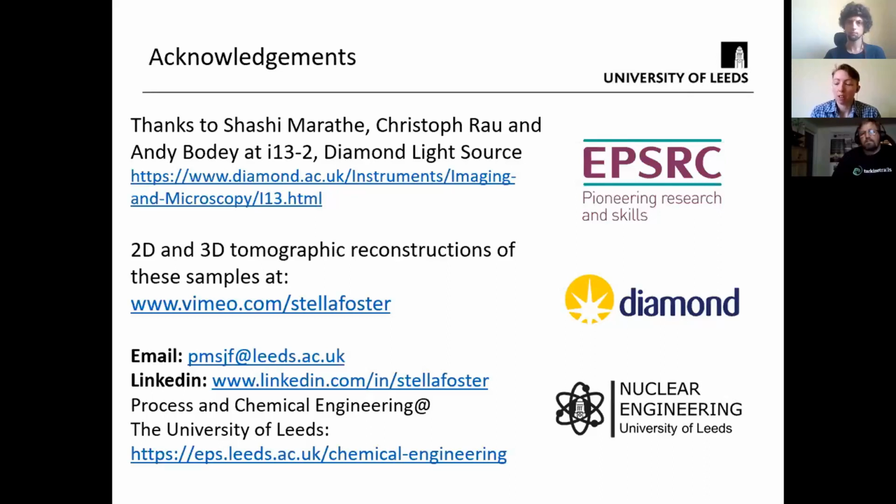The tomography work at that time came secondary to the attempt to modify the biochar with zinc sulfide, which didn't work. The purpose of the low temperature treatment was, I think, I can't remember the exact reasons why, but it had something to do with decomposition temperatures of the sulfur input I was using.